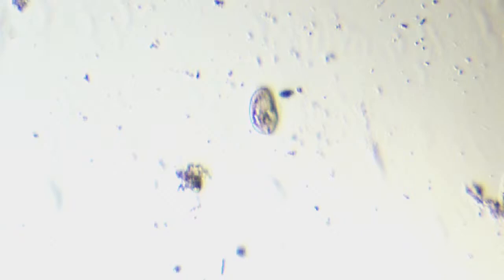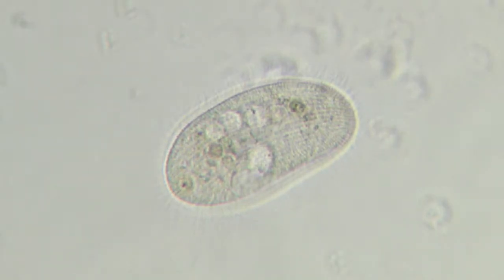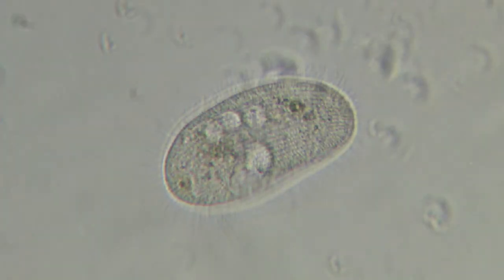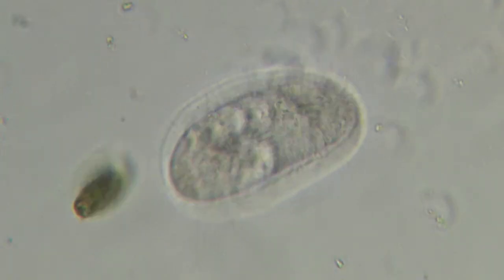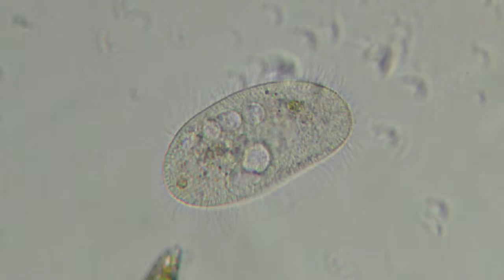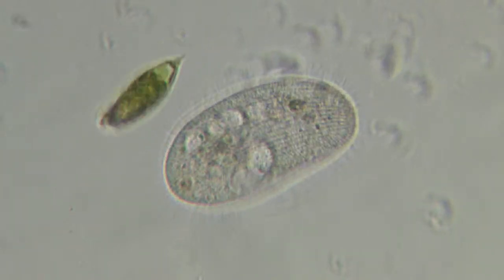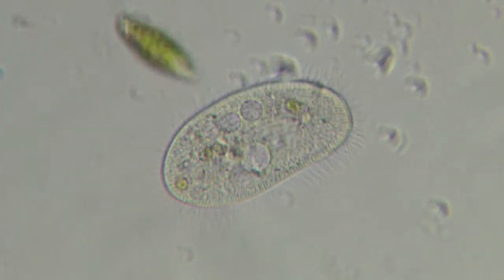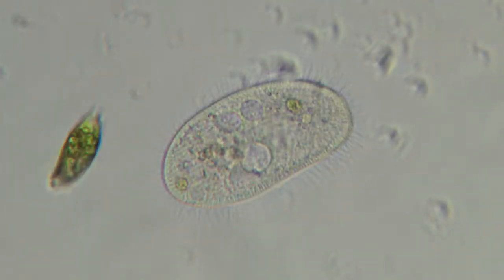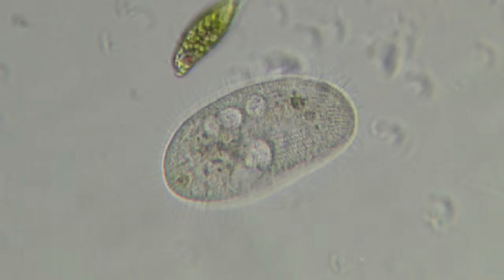Nice, there's a good one right there. See the nice striations on this one. So the cilia are on these like lines. See, it's got some food vacuoles going there, those little spheres. And you occasionally can see the contractile vacuole doing its business to keep the cell pressure so the water doesn't make them pop. I'm not seeing anything moving right now though.